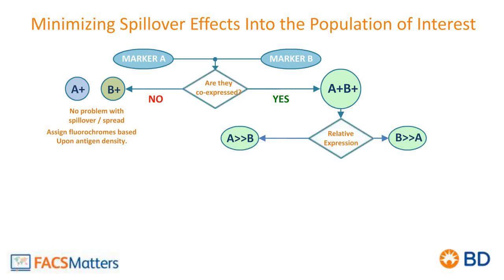First one is, what is the relative expression of A and B? Either they'll be the same, or A will be greater than B, or B will be greater than A.